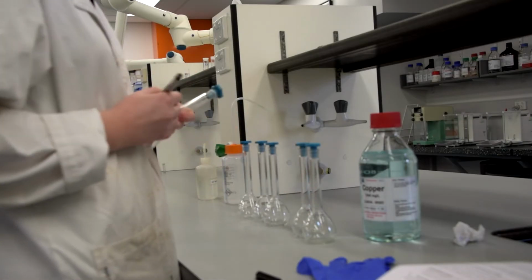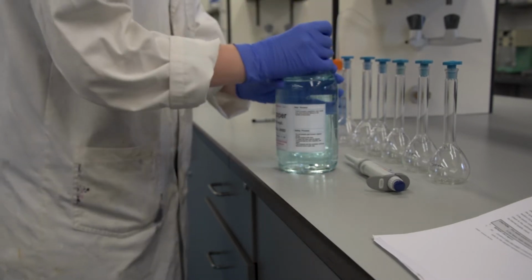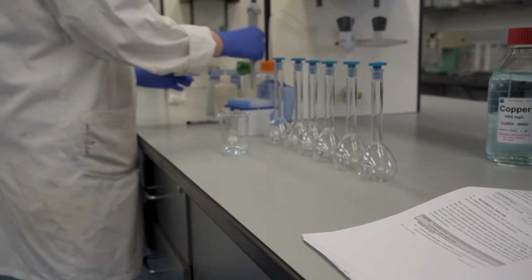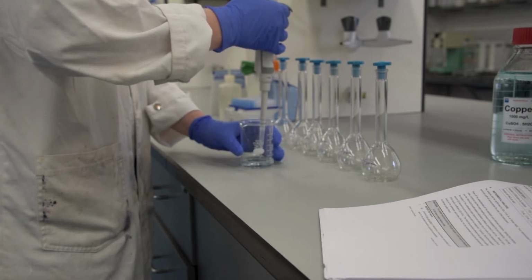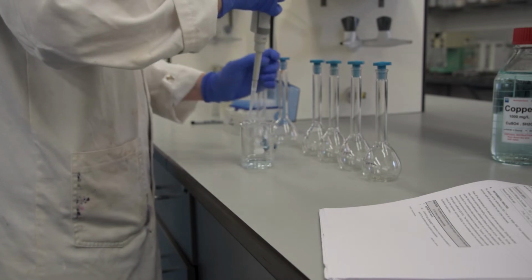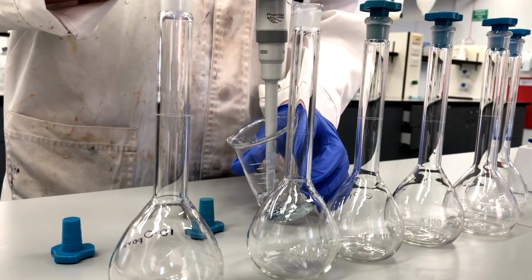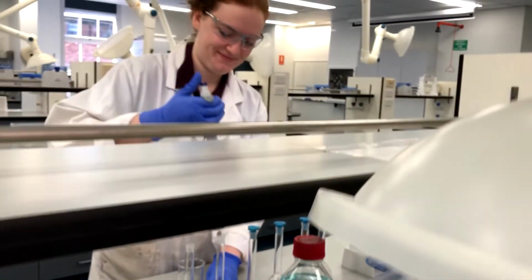A series of standards were made in labelled 100 ml Class A volumetric flasks. To make the solution, the required volume of 1000 ppm copper solution was pipetted using an autopipette into the flask. The autopipette was later calibrated, which will be demonstrated later on in this video. The standards were made to contain 0, 0.2, 0.4, 0.6, 0.8 and 1 ml of copper solution.